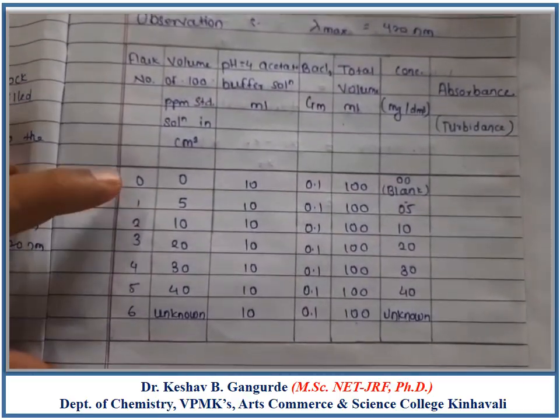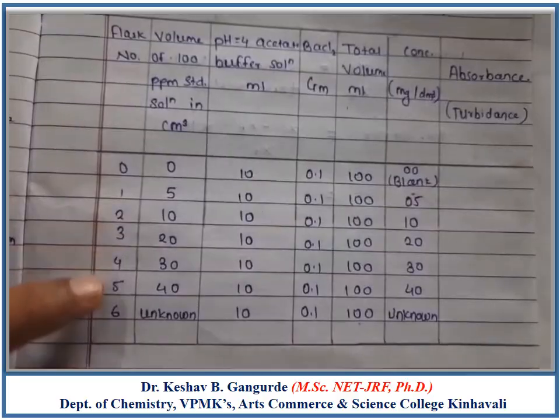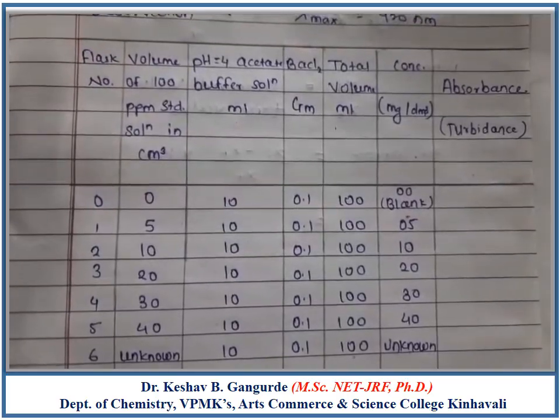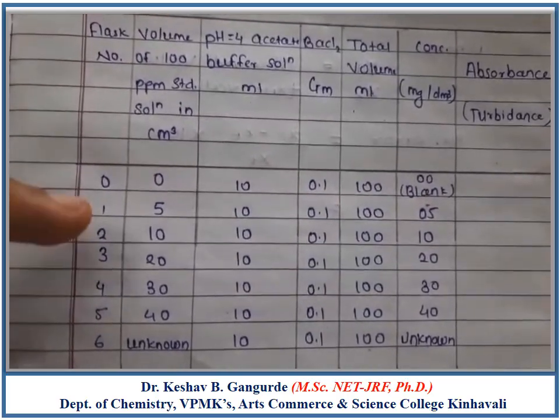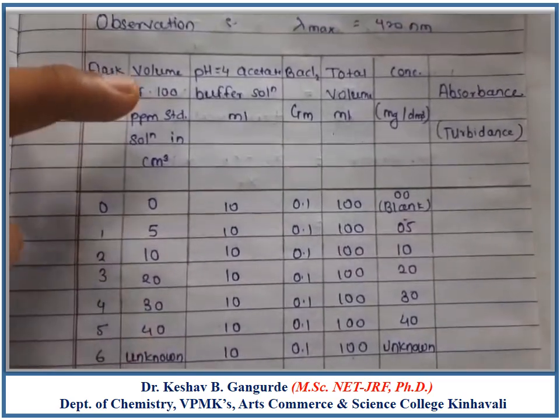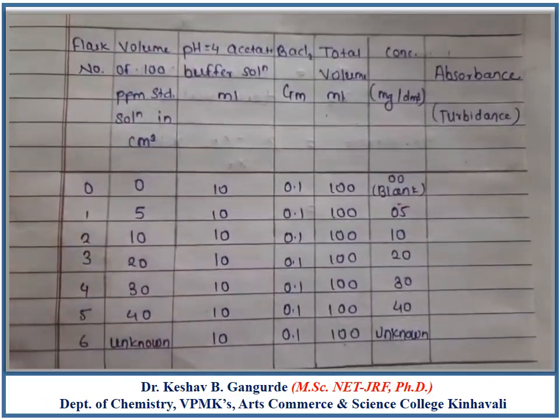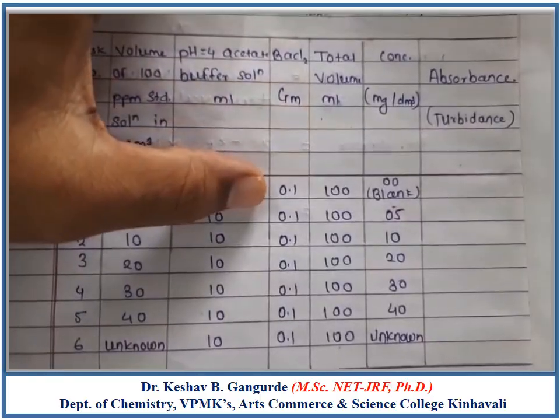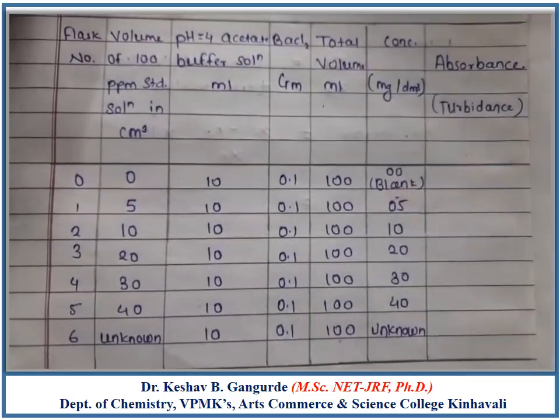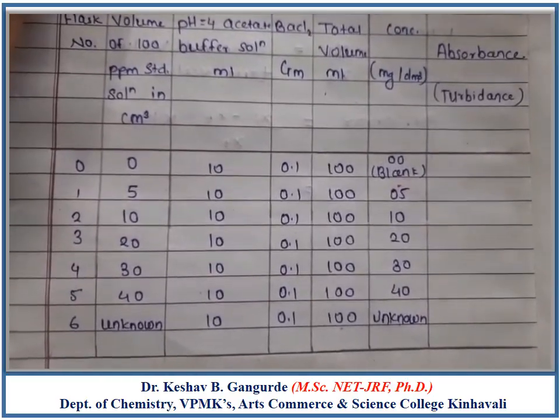As mentioned in the procedure, we have taken 7 flasks numbered 0 through 6. To each flask we added 100 ppm standard solution of Sulphate Iron in increasing volumes: 0, 5, 10, 20, 30, and 40 ml. We then added 10 ml of pH 4 Acetate Buffer Solution to each flask, followed by 0.1 gram of Barium Chloride, shaking each flask vigorously. Finally, each flask was diluted with distilled water up to the mark.